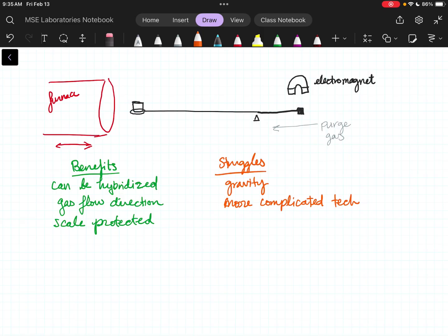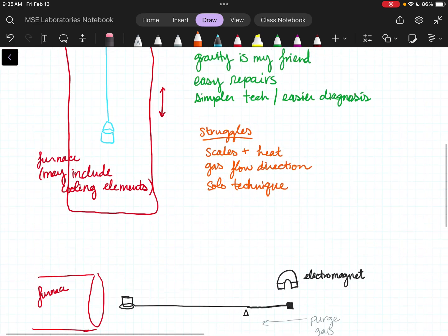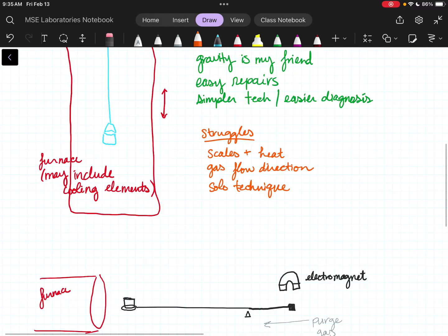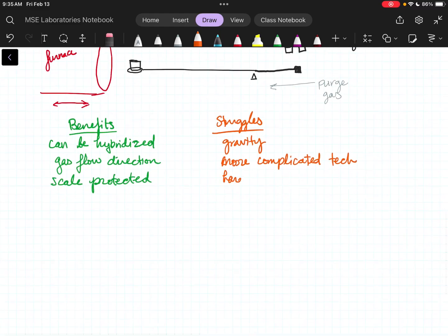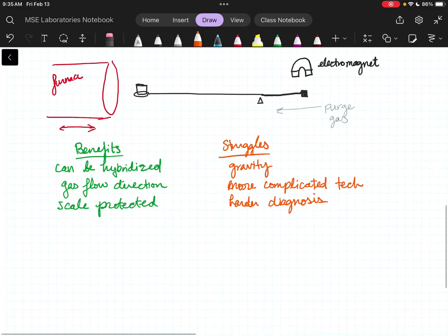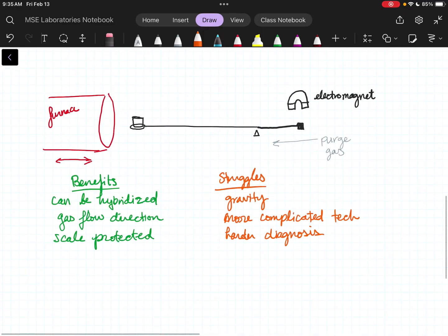I do know that as far as what it gives to the computer, it reports both the voltage values, so uncalibrated, just raw values, as well as calibrated weight values. So it does some conversions. I don't know whether it's the software doing the conversion or the board at the instrument. Everything kind of talks to each other, so it's hard to know where any of that originates on ours.